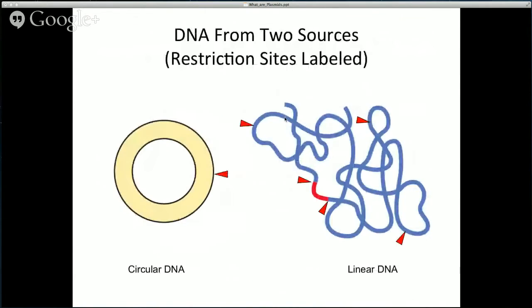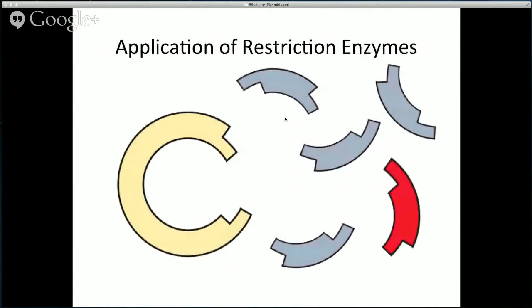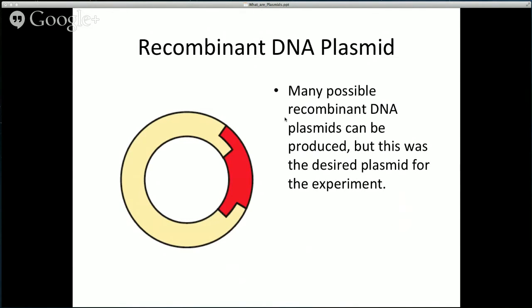Okay, so going back over here, let's just say we have our tube of plasmid, bacteria DNA that we want to cut a gene out of, or just cut in half. And we have another gene that we want to take, so let's say GFP, as you saw in the previous lab, and you want to put it into another plasmid. That is what they call recombinant DNA. So essentially, we have two pieces of DNA. We've cut out the gene of GFP, and we can now put that into another plasmid, say the plasmid with ampicillin resistance.